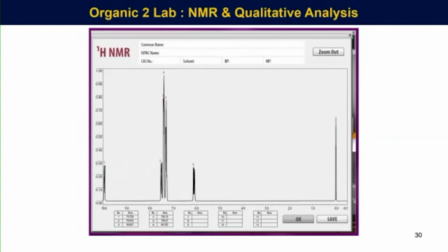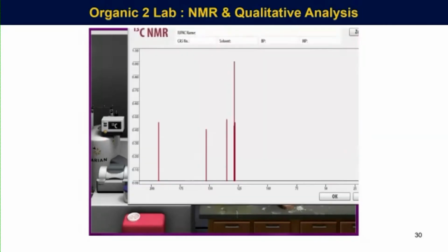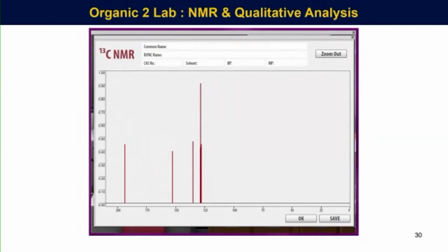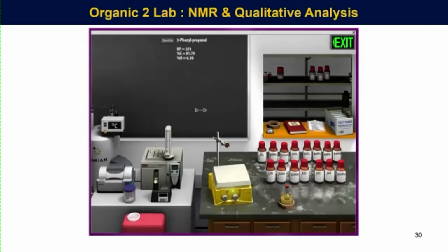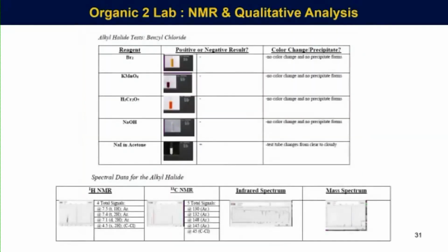They got used to looking at the spectra, and then we'd ask them to interpret the spectra for the report, and they could switch the nucleus very quickly, which I think is genius. You can see the signals, you can expand the spectra, and the students have to look at spectra and analyze them, which is really what we're trying to get done there at that part of the class. So that worked very well. And then they would report this type of data. And because we'd all mixed up the compounds, not everybody had the same data, so we sort of minimized the collaboration, and that was good. And again, the reports became very, very impressive.